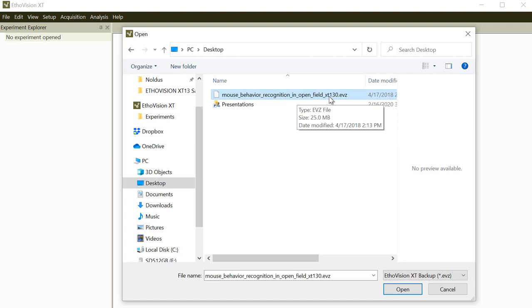This is a sample file which is as large as 25 megabytes, and this can also be downloaded, and we will have a link in the YouTube comments. So if you do not have this file yet, please access the link and try to download it.